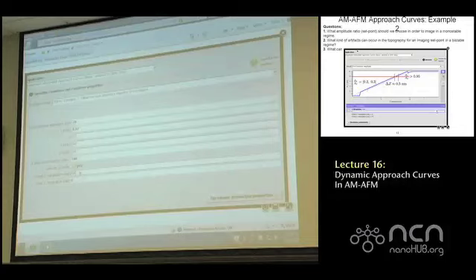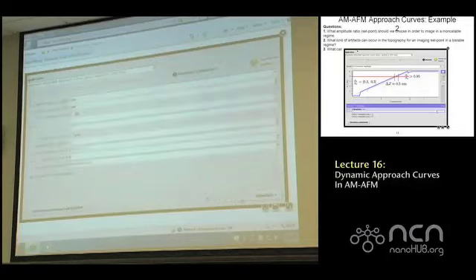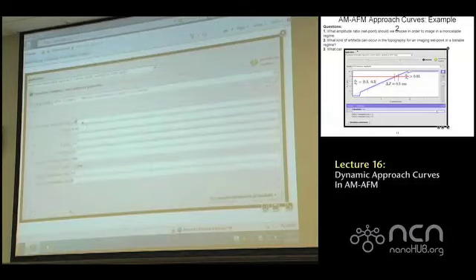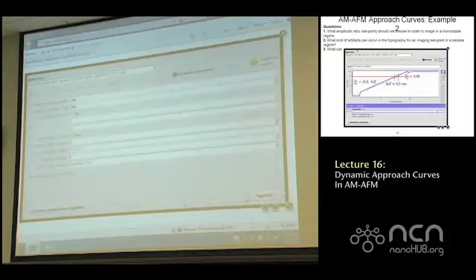Finally, since we have a little bit of time, I wanted to show you this one result, so I'll redo this simulation. I didn't show you anything about time histories yet, but we chose to include 3 time histories, and we're taking them at set point ratios of 0.8, 0.3, and 0.1. And we're going to do 6 oscillation cycles here.